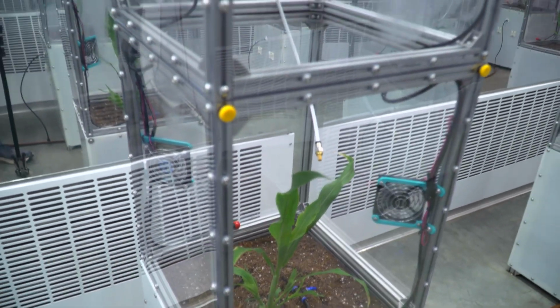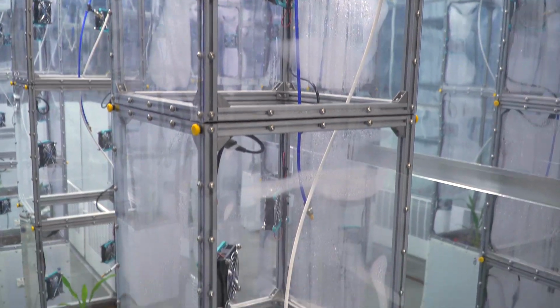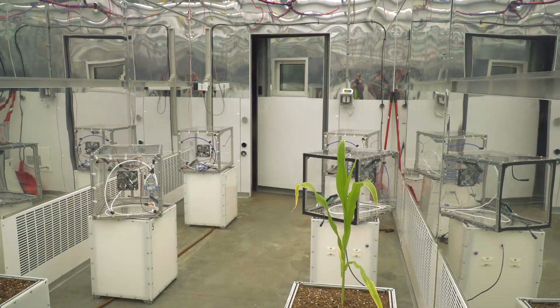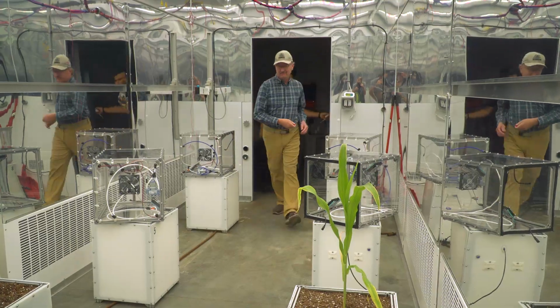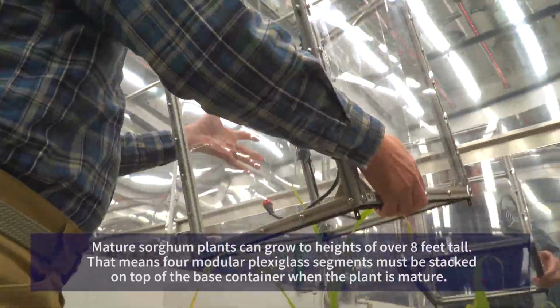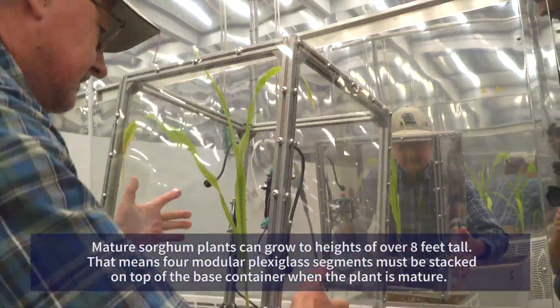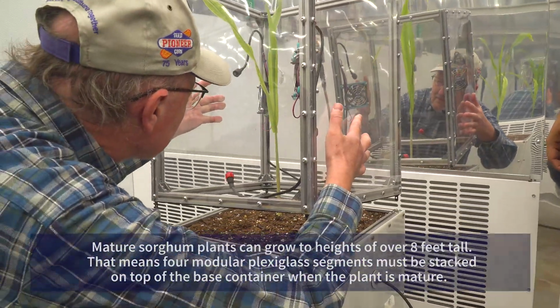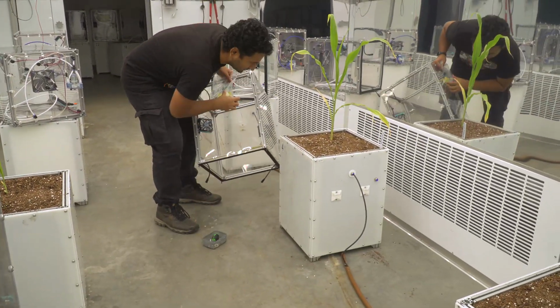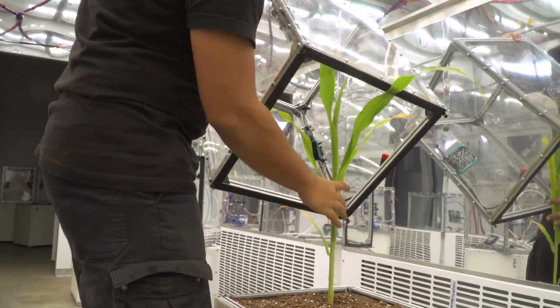Because our highly productive bioenergy grasses grow very tall, that means that we needed growth chambers that were also very tall. And it turns out that on our campus, there were no existing facilities that could accommodate this. We've custom built stable isotope labeling chambers that house individual plants. And when we're ready to add the stable isotope label to determine what's happening in the plant and in the interactions between the plants and the microbes, we put the cover over the top of the chamber.